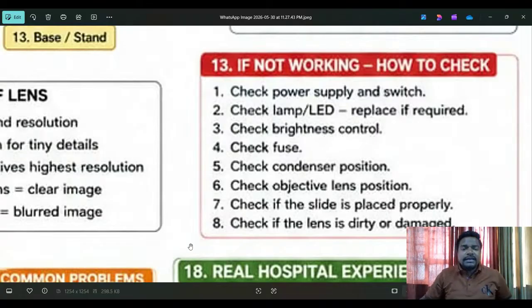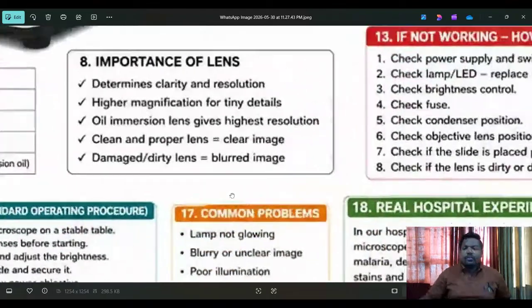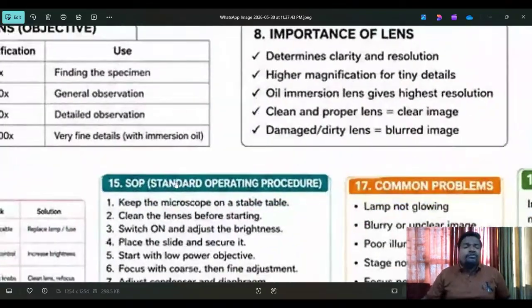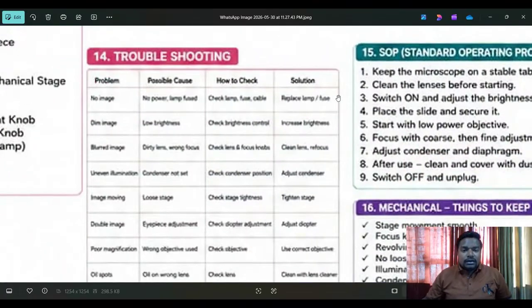I hope you got it very clearly. My expectation is only that you listen very clearly and implement it in your day-to-day life. It is a very, very informative channel, and this is not available on local social media. Now the 13th point is complete out of 24 points. Now come here, try to see it.